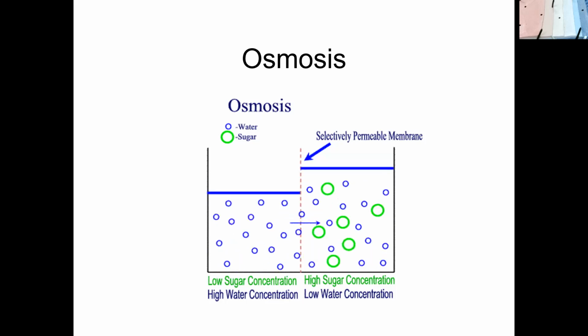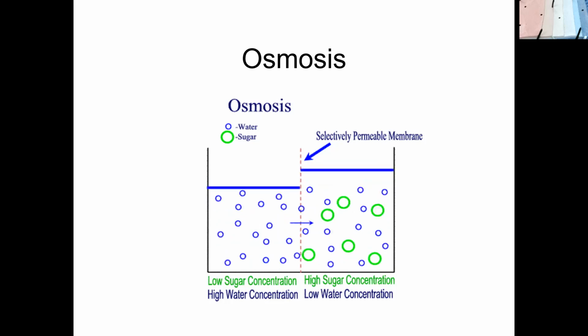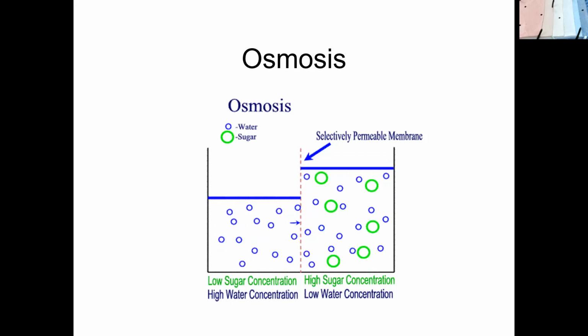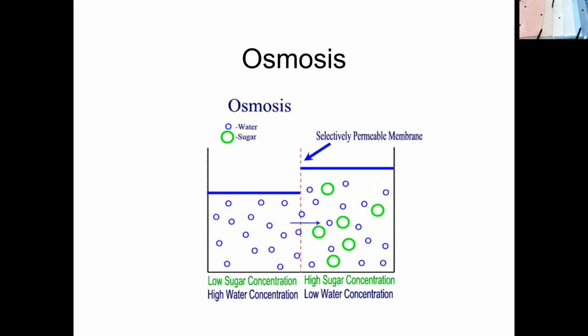We've done different experiments in the past here with 40% glucose. So we take 400 grams of glucose and mix it up with a liter of water. If it's 40% glucose, what's the water concentration? 60%.